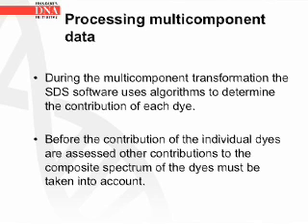We will now go on to processing multi-component data. During the multi-component transformation, the SDS software uses algorithms to determine the contribution of each dye. Before the contribution of the individual dyes are assessed, other contributions to the composite spectrum of the dyes must be taken into account.